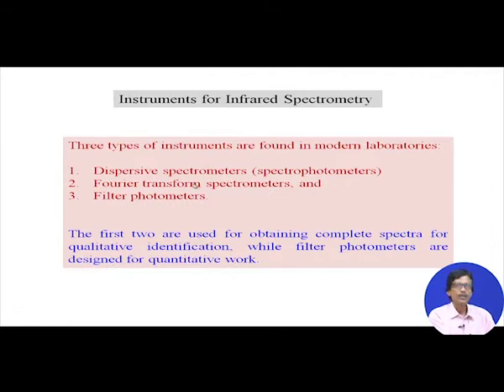Because we know that in UV visible spectroscopy, utilizing Lambert-Beer's law, we can figure out the unknown concentration. Similarly, by looking at the corresponding stretching frequency, that means if we monitor the corresponding amount of transmittance or absorbance, because these two are related, absorbance as well as transmittance, we find that quantitatively we can also monitor the corresponding concentration in the case of these filter photometers.